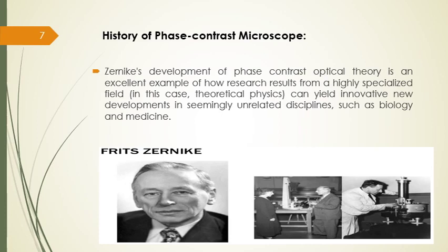Modern phase contrast objectives designed and produced by Nikon and other optical manufacturers are capable of operating in combination with auxiliary contrast enhancing techniques such as differential interference contrast, fluorescence, and polarized light. These objectives are available with internal phase plates that have varying levels of absorption and phase displacement of surround illumination, to produce a wide spectrum of specimen contrast and background intensity choices in phase contrast microscopy.